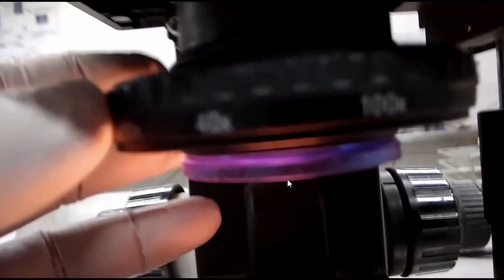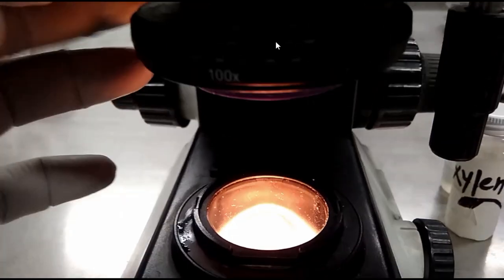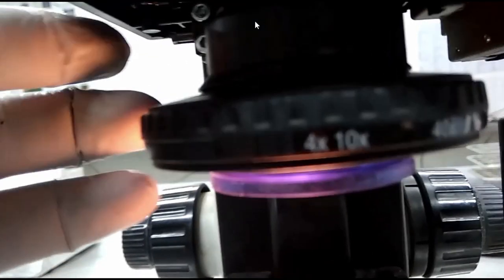So this light passes through the aperture, condenser, at the stage, and then from the stage to the objective lens, and via the objective lens to the eyepiece, and then finally to our eyes. The microscope is binocular because it carries two eyepieces for both eyes.